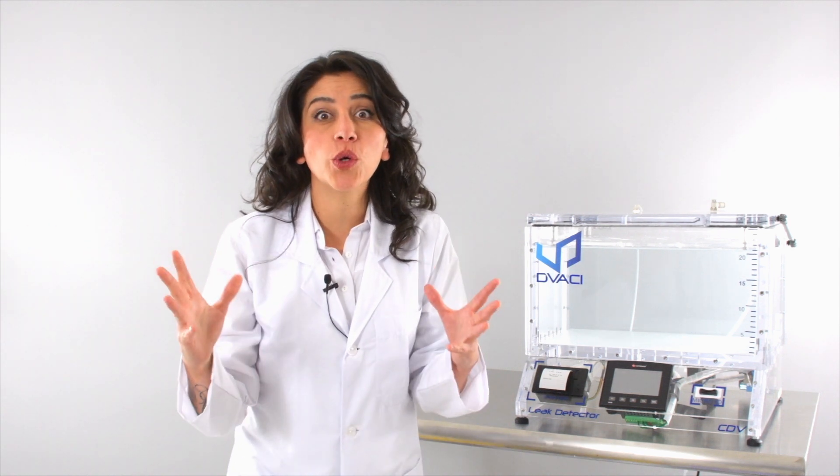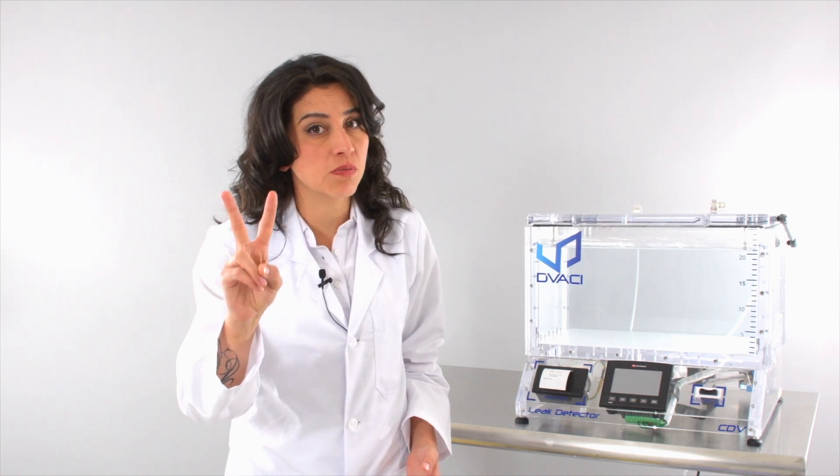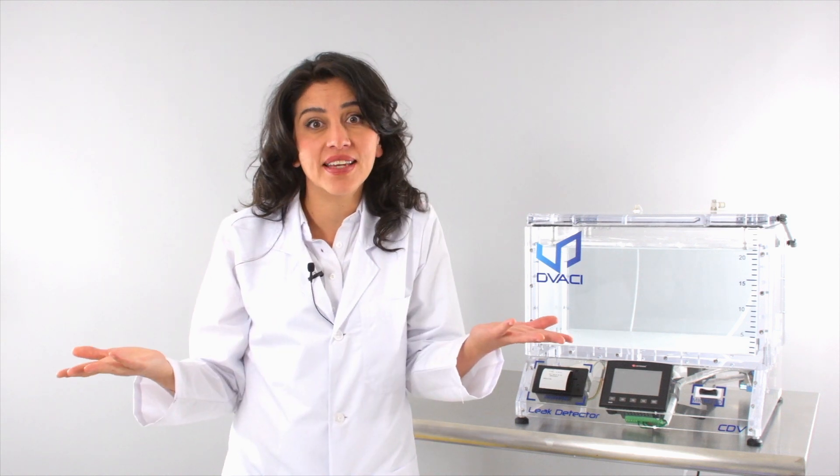Hey everybody, welcome to our new video. Today we're going to show you how to test packed meat in a vacuum chamber. We're going to show you two ways to test this pack and see if it has any leaks.